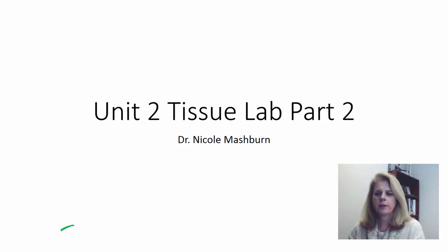Hello, Nicole Mashburn again. And so we're going to continue with our tissue lab. So this is part two. Part one covered all your epithelial tissues, and part two will cover your connective tissues, your muscle, and your bone.